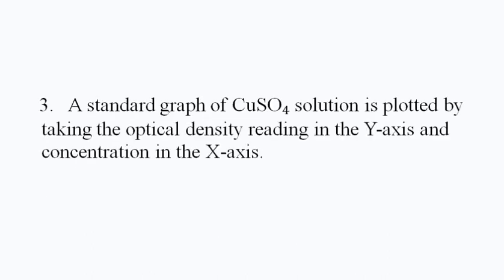And then after the practical, after measuring the optical densities of the different solutions, we are going to plot a standard graph of copper sulfate by taking the optical densities. The optical densities will be obtained after the practical, and then we are going to plot the optical density against the concentration. The optical density will be plotted on the y-axis and the concentration on the x-axis.